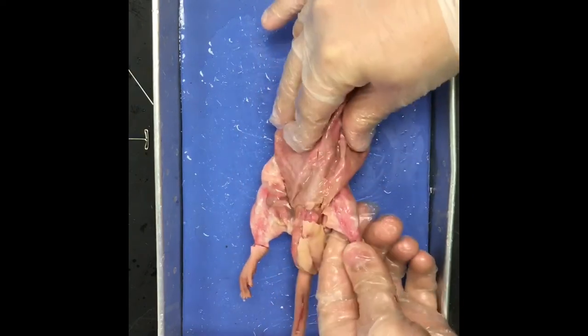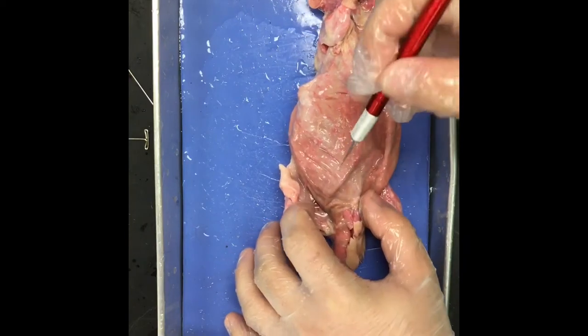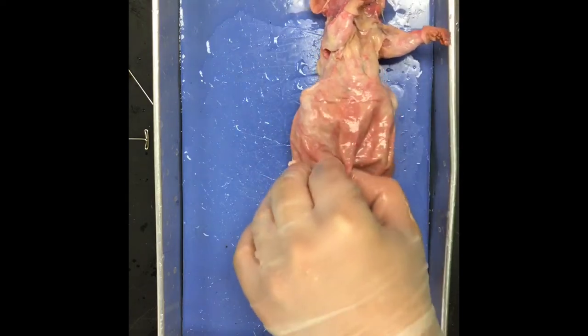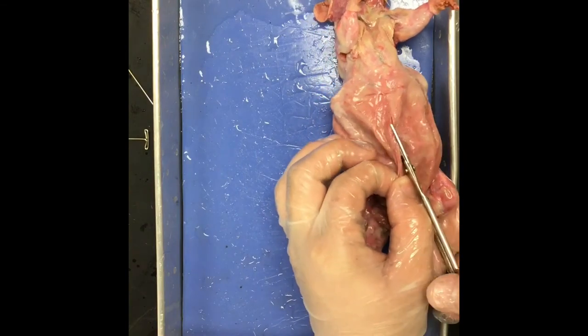So, those would be the bones in the legs. It's a lot easier to do that than it is to expose it because the rat's bones are extremely small. So again, the same way you did at the beginning, you start at the bottom and give yourself a little start hole there, and you take some scissors. Boop. Come through.